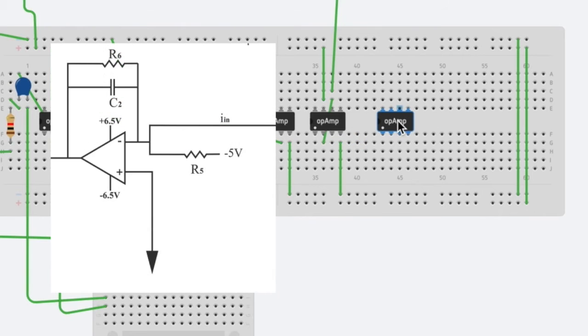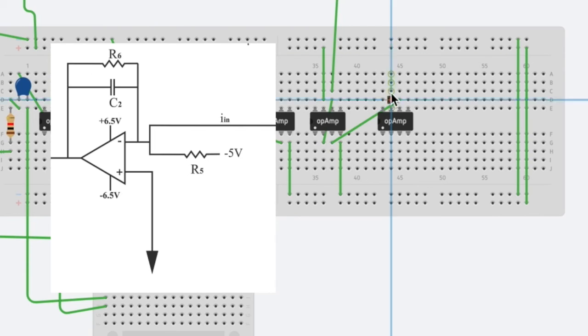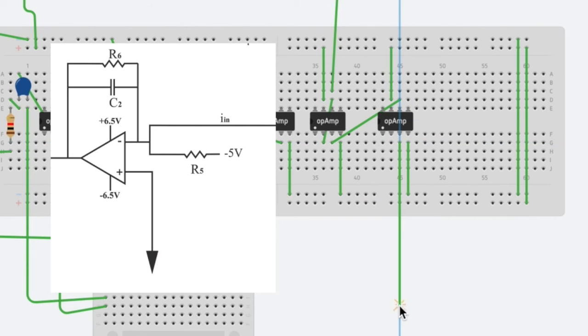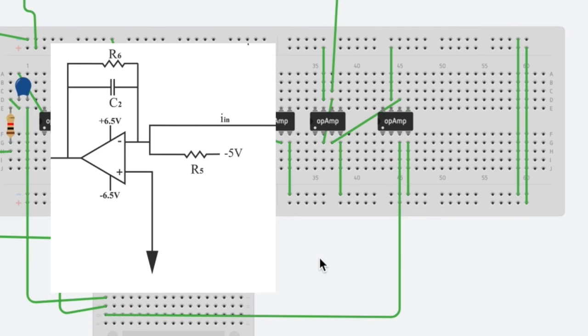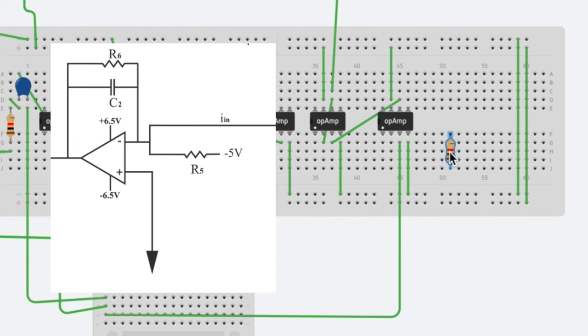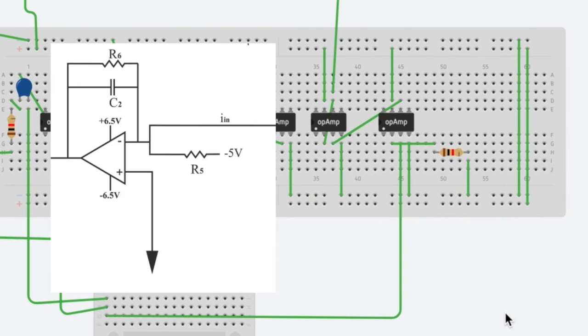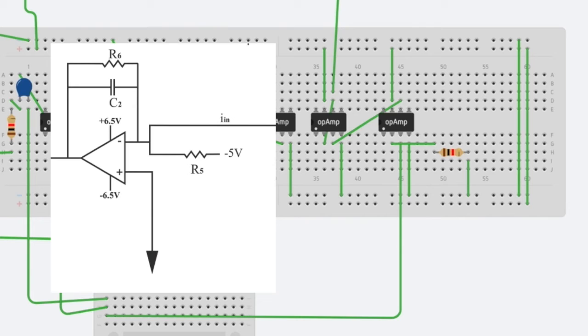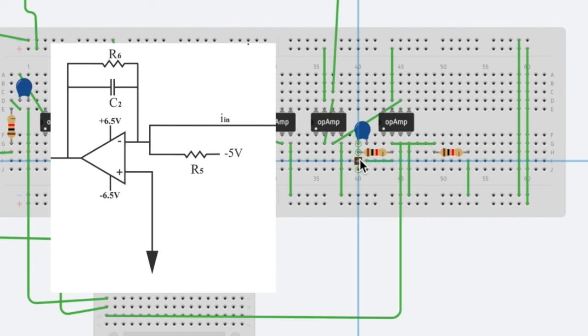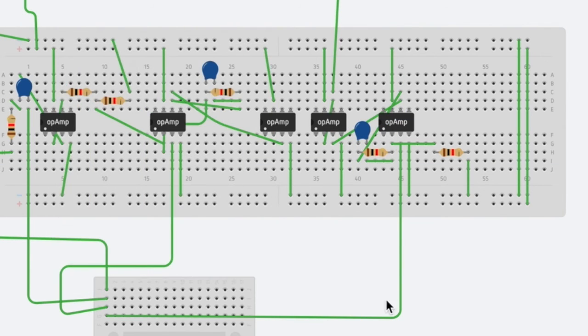This next amplifier is the transimpedance amplifier. It's very similar to the summing amplifier in that we have a resistor and capacitor connected in parallel to the output and inverting inputs of this op amp. We also have the non-inverting input being connected to ground. Additionally, in the inverting input, we will have a resistor connected to the minus 5 volt power, and we'll also have an additional wire going to our working electrode. This is noted as the IN in the circuit diagram.